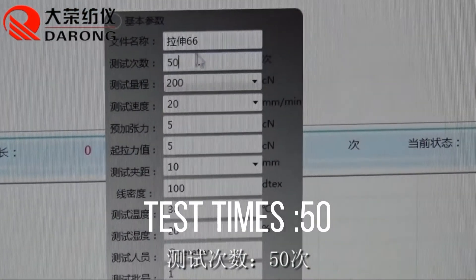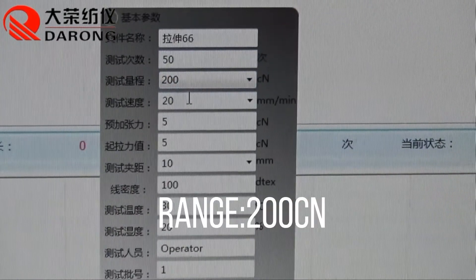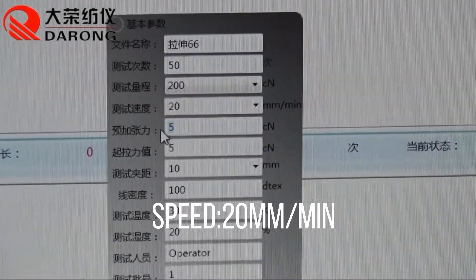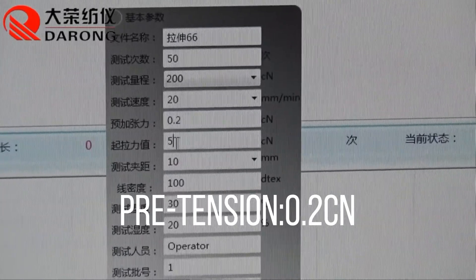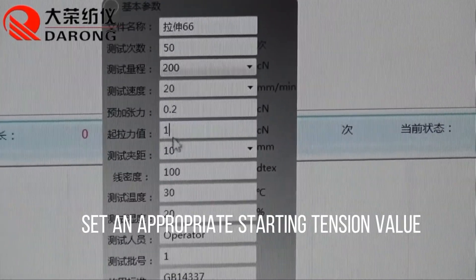Set test times to 50. Range: 200 cN. Speed: 20 mm/min. Pretension: 2 cN. Set an appropriate starting tension value.